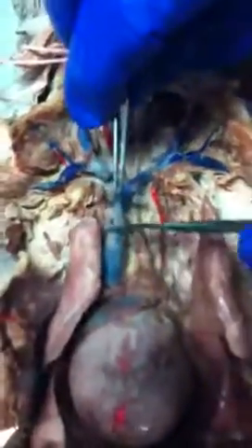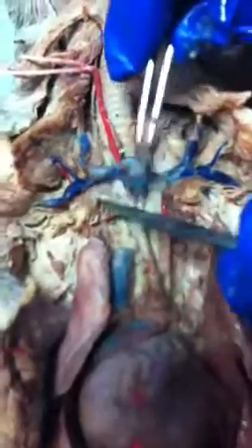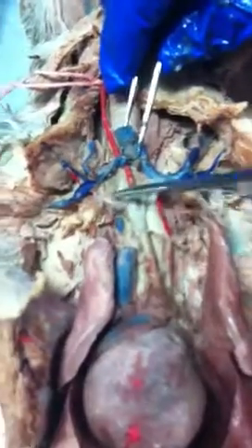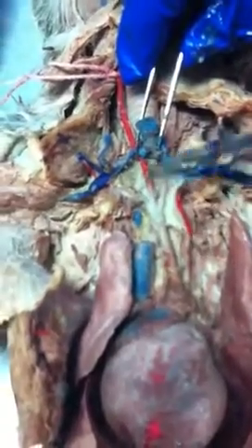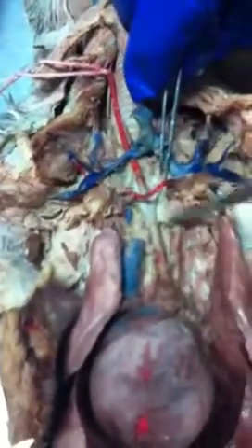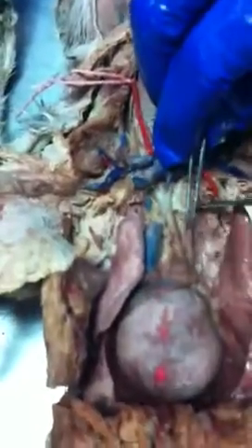Now, I'm going to disconnect you to show you the trifurcation of the brachiocephalic. Everybody see that? 1, 2, 3. The one that's going off towards the right upper extremity, that's right subclavian. The middle one is right common carotid. And this one that's most to the left is left common carotid. Left subclavian is branch number 2. It comes off all on its own. Okay?